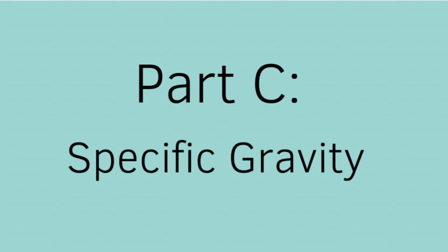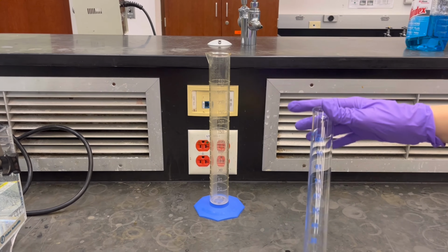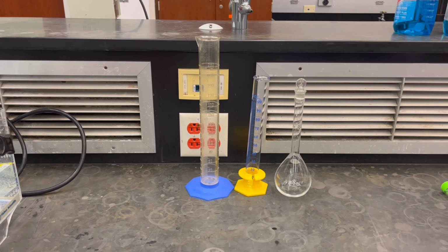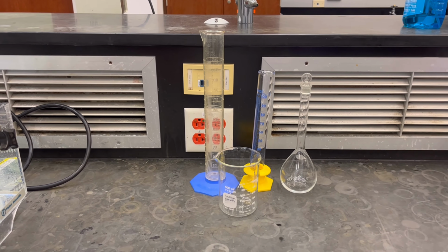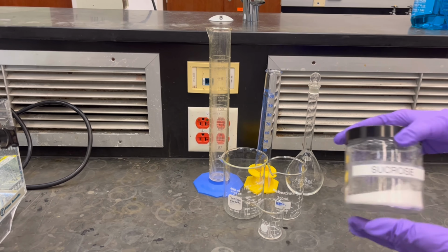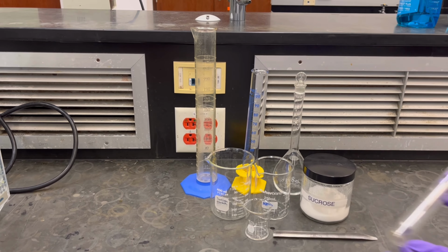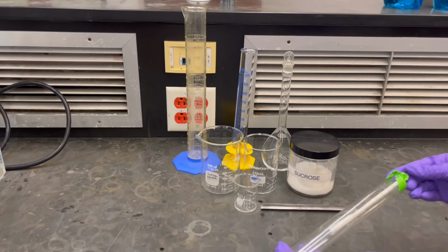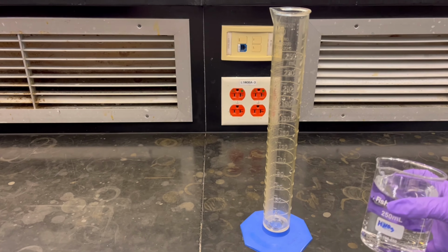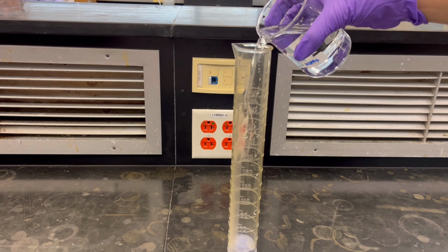Part C, specific gravity. The things we will need for part C are a 250 milliliter graduated cylinder, a 100 milliliter graduated cylinder, a 250 milliliter volumetric flask, a 400 milliliter beaker, a 250 milliliter beaker, a 50 milliliter beaker, sucrose, which is sugar, a spatula, and the hydrometer. Now measuring the specific gravity for water. We will obtain 200 milliliters of DI water and fill our 250 milliliter graduated cylinder until the 200 milliliter mark.